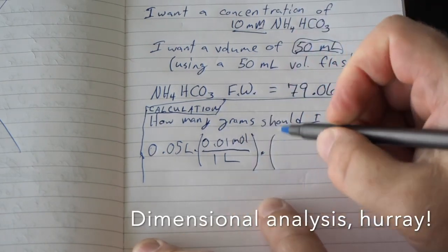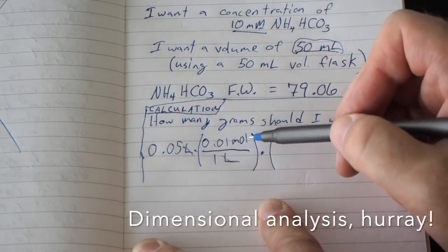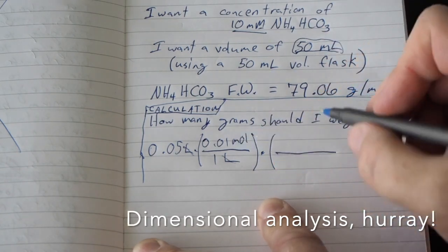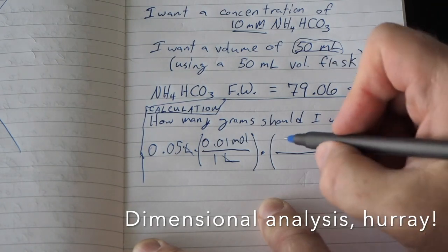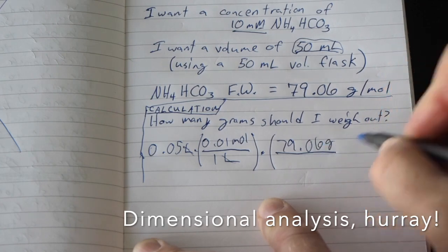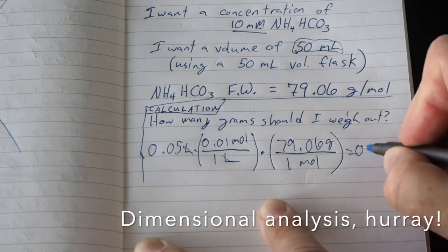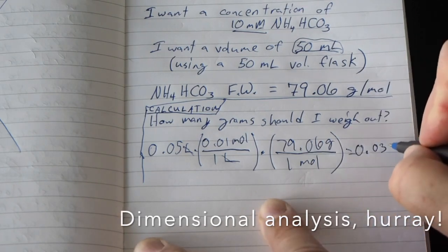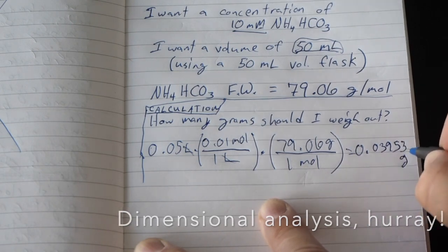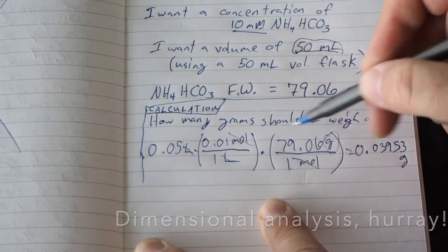And then my next conversion factor, I've just canceled liters, and I've got how many moles of ammonium bicarbonate I need, but I want to know how many grams to weigh out, so I'm going to convert that moles to grams using the molecular weight, or the formula weight. There's 79.06 grams of ammonium bicarbonate for every 1 mole of ammonium bicarbonate. On my calculator, that came out to 0.03953 grams is my units. Sorry, I ran out of space there, but that's my units I'm left with, because moles canceled and liters canceled.